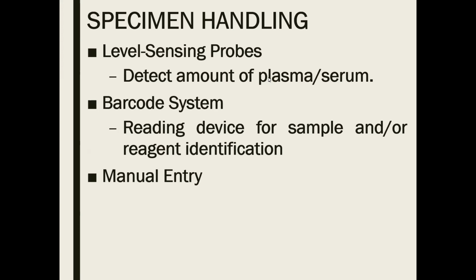Pwede po yun, it could be, but through the help of barcoding instead of doing manual testing, because manual entry can also cause interference. Para kasi ang mangyayari doon is that, okay, sige, parang ganito yung mangyayari doon. Input mo, okay, pagka-input mo, pangalan ng patient, ano yung mga test? Click mo yung mga test. Okay, pwedeng mangyari, mali yung kulang yung test na na-input mo or sobra yung test na na-input mo. That's what we call manual entry.